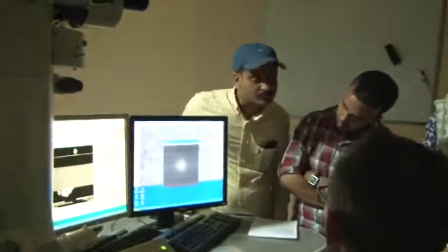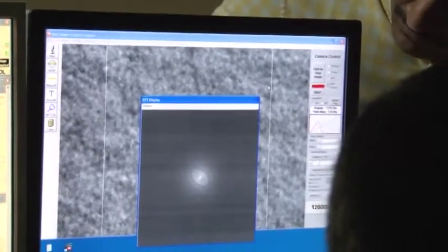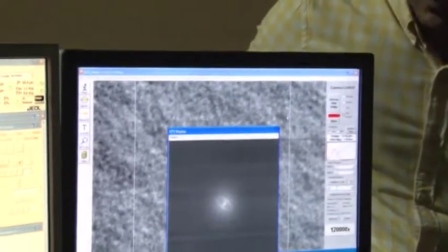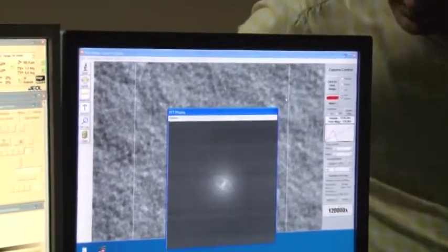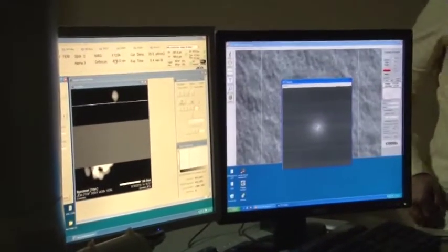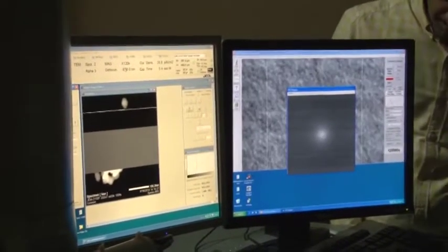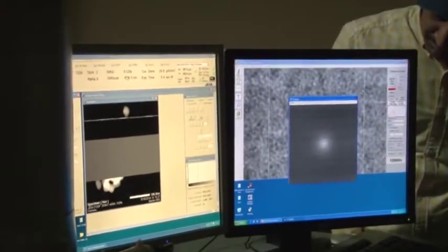Yeah. So now it is in this direction. You see already some streaking, under focus, or even further. I mean, this is not bad. So now I think we can already see it should be streaking from the lower left to the upper right. This is what you can use to optimize the objective stigmation, because the low magnification includes the repeatability. So I am correcting it again, and it becomes more circular, more or less.